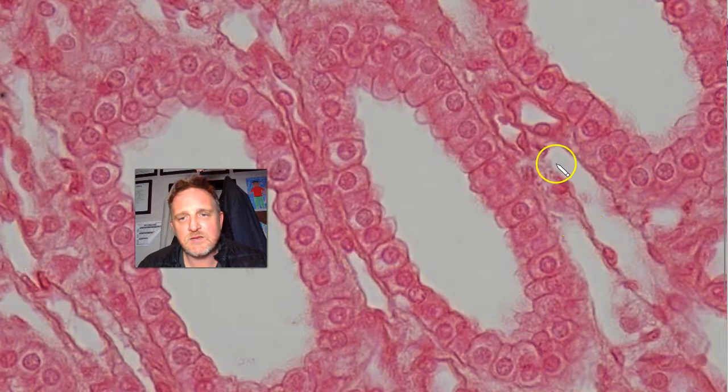And then we looked at this loop of Henle, the thin duct, lined by simple squamous. And then I noticed on this side also loop of Henle. Now, we can easily mistake microscopic structures when they become really small and refined. I do it all the time. So don't become stressed out or upset with yourself if that happens. Like we've been saying, baby steps, take it one day at a time, one image at a time.